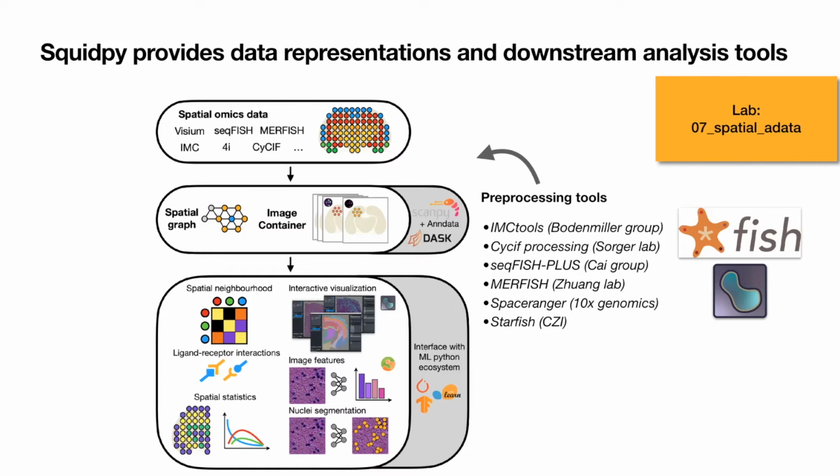So when we wrote this toolbox, we looked at what people in general use and tried to think of more tools from, say, computer vision or other related disciplines to make a nice comprehensive toolbox of things that you can use to analyze the data.